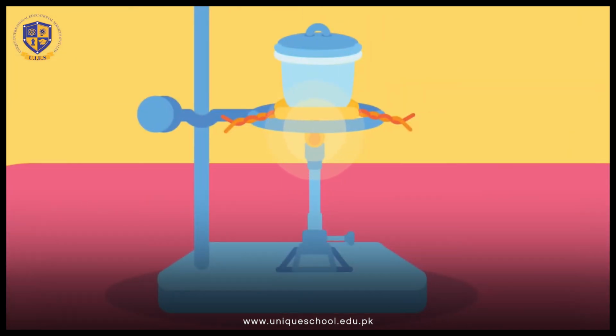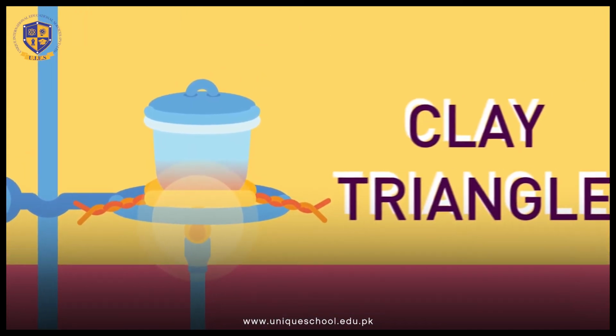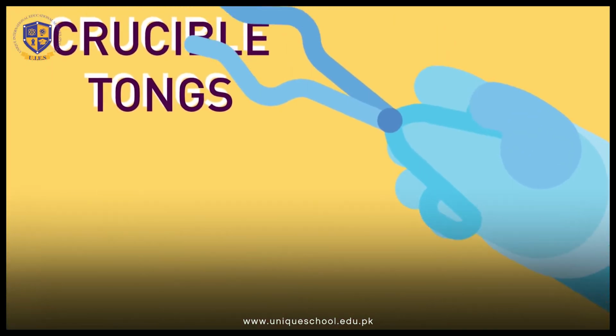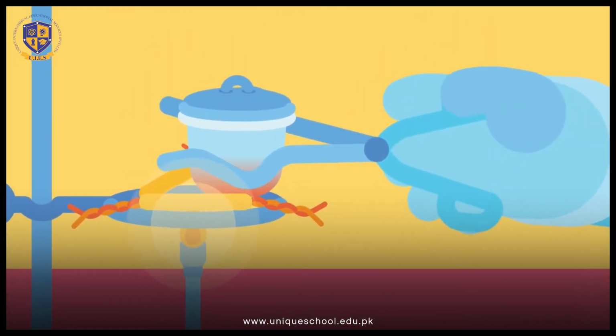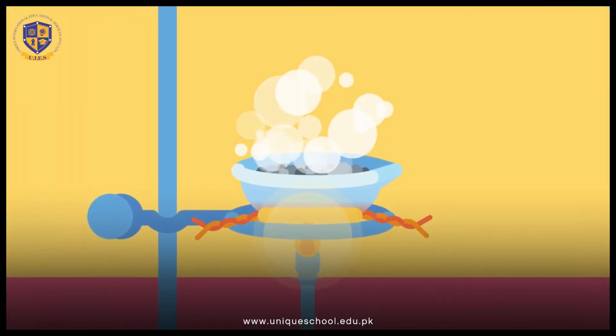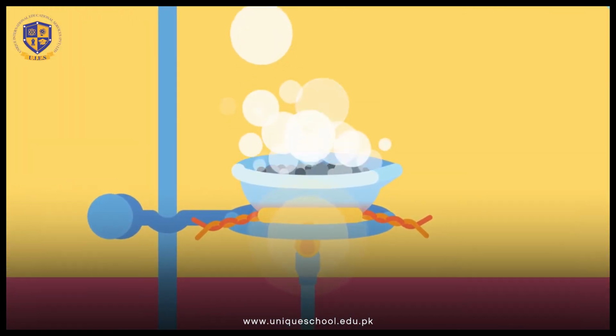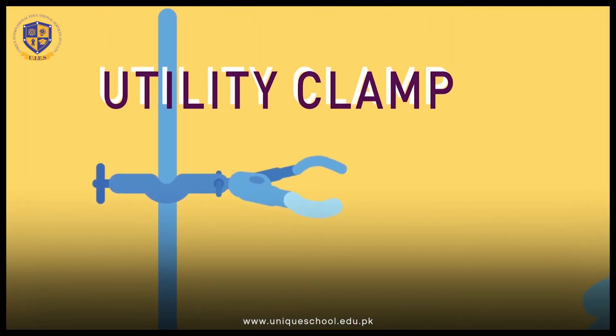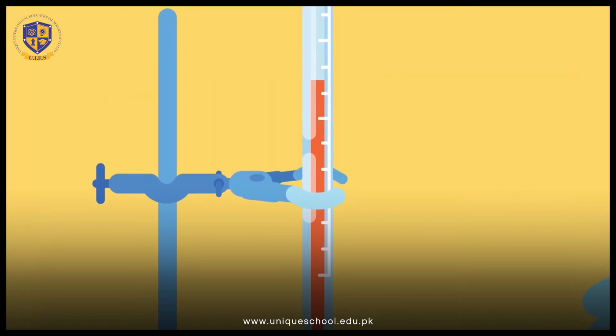Crucible. A ceramic pot used for holding chemicals during heating at very high temperatures. Clay triangle. A metallic triangle used to support a crucible during heating. Crucible tongs. Used to hold crucibles. Evaporating dish. A wide ceramic dish used to heat liquids for evaporation. Utility clamp. A metallic clamp used to secure glassware to a ring stand.